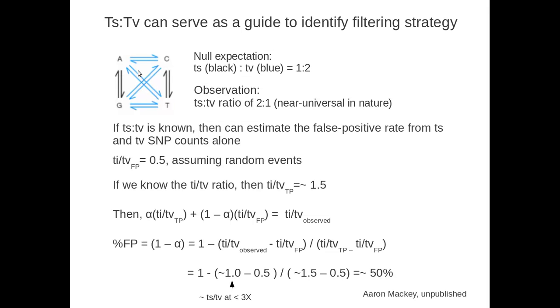So what I do is I say, okay, I'm going to look at all variants where the quality is a Phred score of less than 20. And what I would expect to see is that the transition-transversion ratio will be lower in that class of SNPs than in a higher quality set, say a set with a Phred quality of 30, which is a 1 in 1,000 error probability, compared to a Phred of 20, which is an error probability of 1 in 100. Okay, so the higher error probability set, the set where we're more likely to see errors, we would expect to see the transition-transversion ratio to be lower.